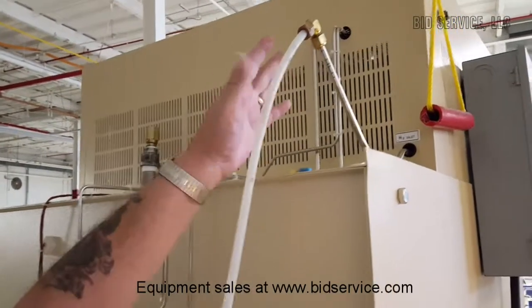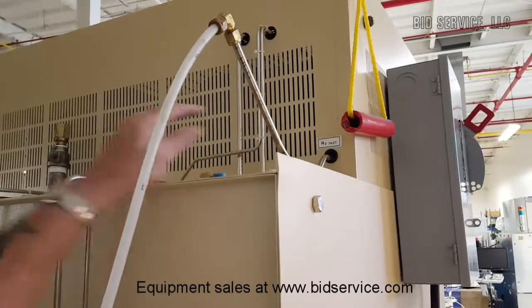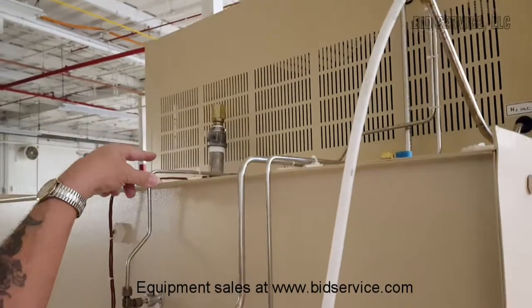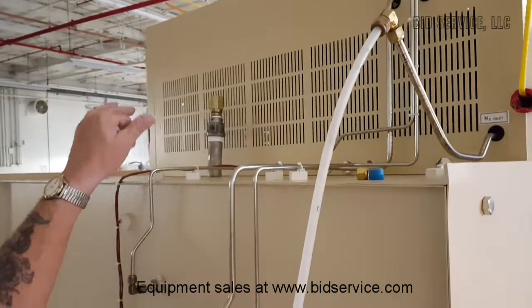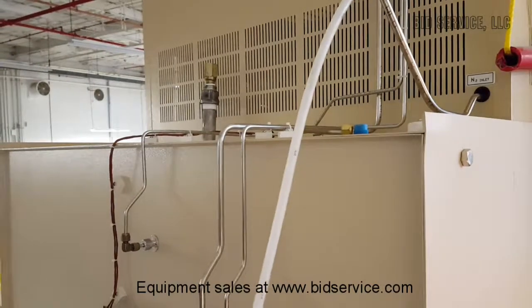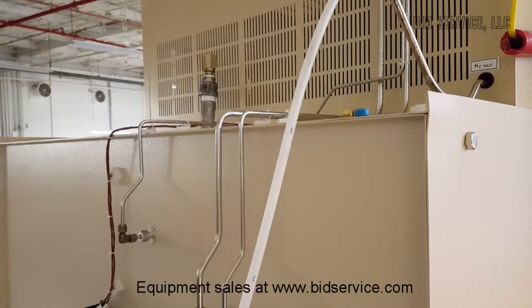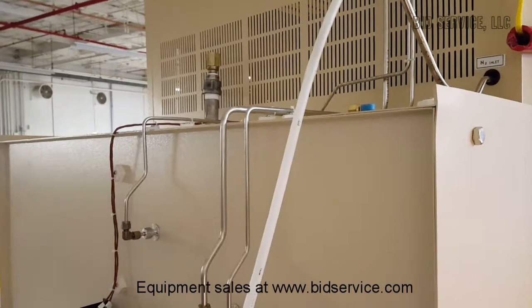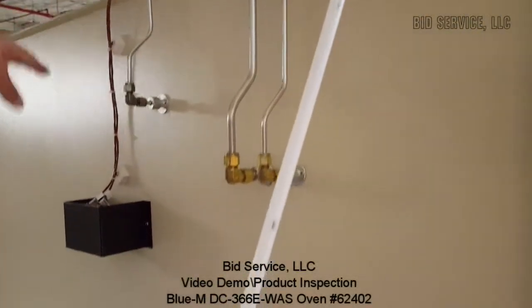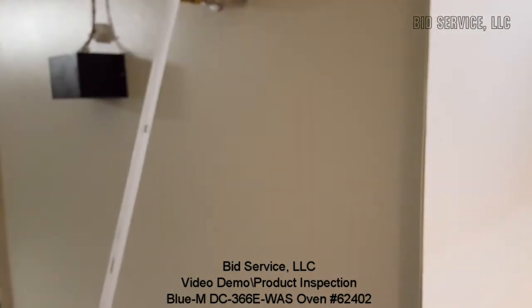This is covered in the manual. Right here is your input to the purge flow through the cabinet. On top, in the center, is an exhaust if you wanted to use it. You do have to be careful on how you hook that up, because you don't want to create a vacuum effect when pulling heat out of the oven, as it may have a more difficult time controlling — but it's usually not an issue, and it's covered in the manual. Your sensors from the controller — this is the wiring and the sensors into the back of the oven that I pointed out before.